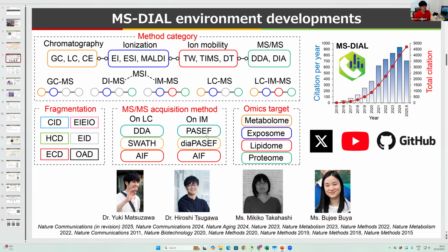This program can now also accept mass spectrometry imaging data. And if you are interested in PASEF or DIA-PASEF of Bruker instruments, you can process such data in this MS-DIAL program.